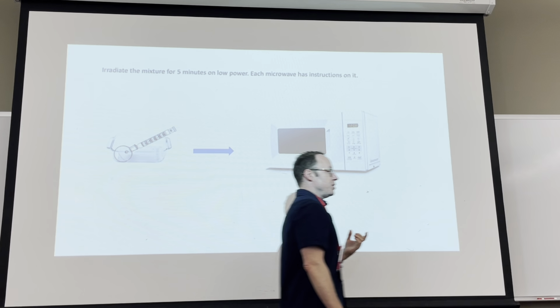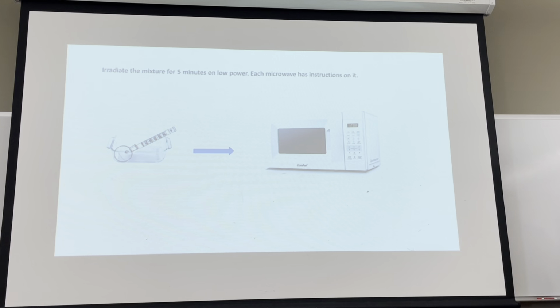What I would recommend you do maybe is, once you get it back to your bench top, set it on the bench, hold the Vigreux column and put a Keck clamp on them. Okay, once they're clamped together, you can hold it by the Vigreux column, then you could just hold it under some running water to cool it down quickly, and you don't have to wait for it to cool at room temperature. Okay, but once it's cooled, you've held it under some running water, you got it down to room temperature, you're going to pour the contents in a separatory funnel, right?